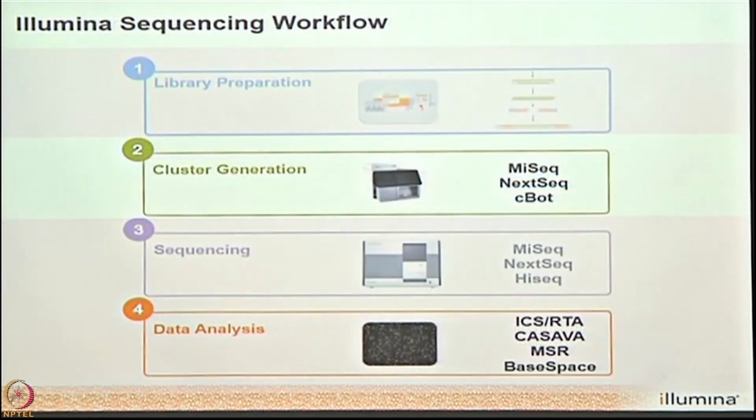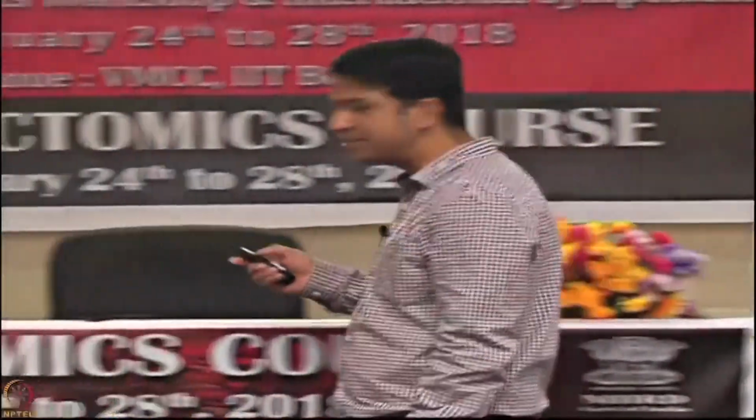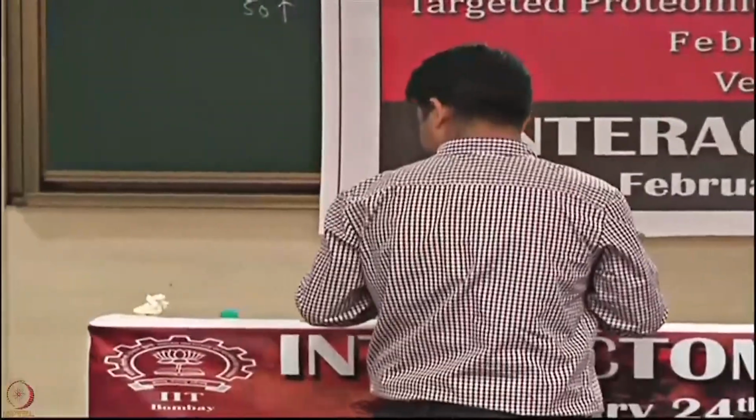So this is all about library preparation. Coming on to the cluster generation. So now what is cluster generation? Essentially all the process happens on the flow cell, right? Flow cell is nothing but a glass slide. You can see there are two flow cells.